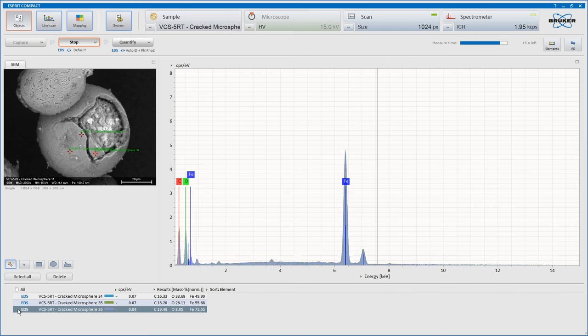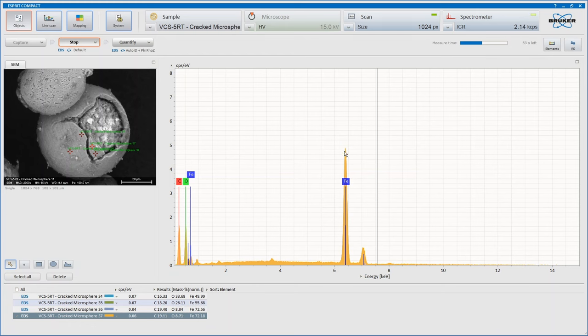I think we'll actually do another sample point. Can we get one on the edge of there, or is it going to pick up something else? Probably pick up something else. I'll do another one here. Wow, by mass, that is very high. Wonder if we can capture one of these cracked eggs, edges. It's just likely to pick up some stuff in the background there, that's the problem. Or over here. This is getting to a really good indication of what the purity of this iron is.